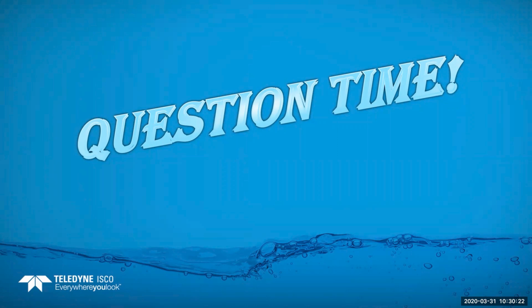What if I need to take samples 32 feet deep? Is there any model which can do that? So no, it's actual physics. It's the law of physics that you can only pull a sample up with a vacuum about 32 feet. There's no sampler out there that will actually pull it higher than 28 feet. It's just a physics thing. So we just can't do it.